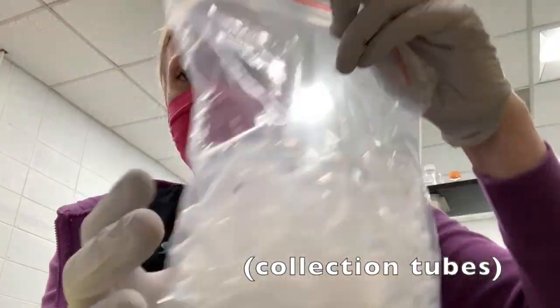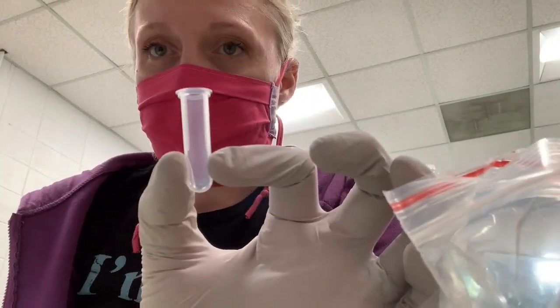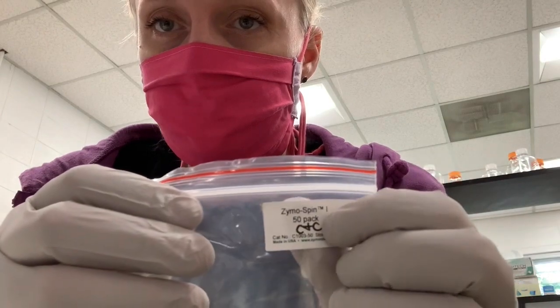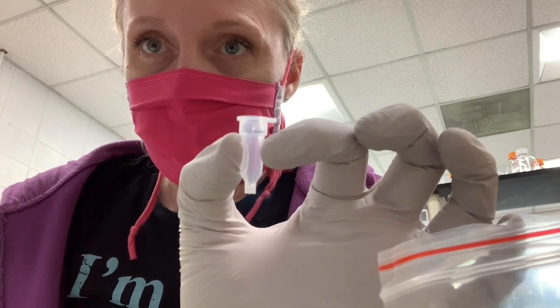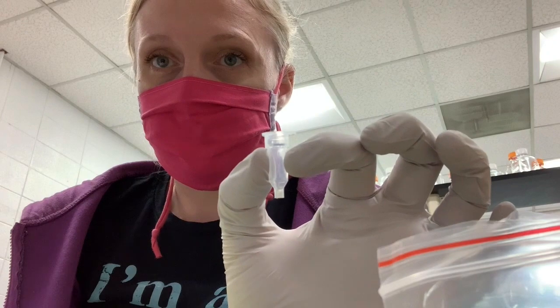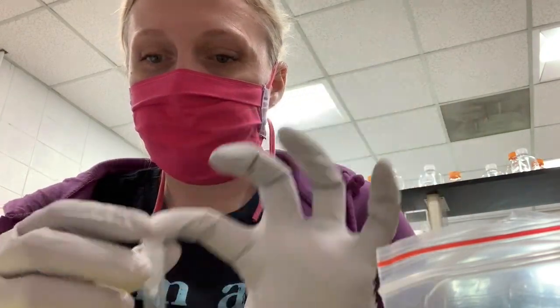The other component of the kit is a set of tubes called collection tubes. They look like this. You'll need one of these for each of your samples. And then there are also columns. And these are the Zymo Spin 1 columns that look like this. There are also columns in the mini prep kit that look a little bit different. And so if you've seen both of these, the mini prep columns have a wider filter at the bottom than the ones for the cleaning concentrator. And you're going to have one of these per sample. You're going to put them into the tube like that.